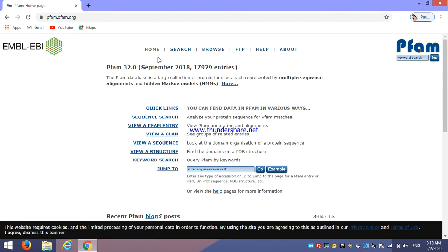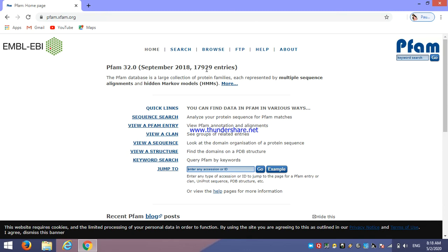So this is the home page of PFAM. Here we can see the recent version is 32.0 and it is released in September 2018, which contains about 17,929 entries.